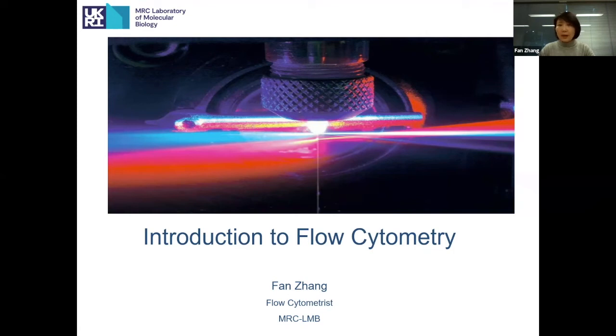I am the scientific staff here in LMB, specialized in flow cytometry. Today, I'm going to give you an introduction to flow cytometry. You can put your questions in the Q&A box, and I will answer as much as I can at the end of this talk.